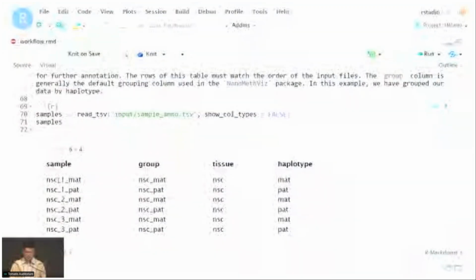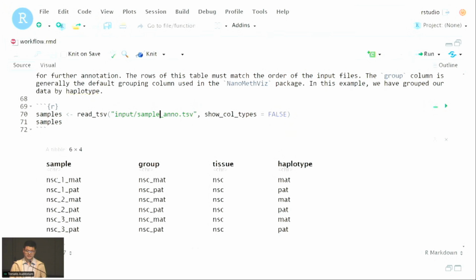so these were neural stem cells, and I've haplotyped them. And that's the reason we have the crossing between pure strains, is that using long reads, you can actually very easily and effectively haplotype most of your reads. So using short reads actually is quite a challenge because your short reads need to overlap informative SNPs. Using long reads, it becomes much easier to do any kind of experiment where you want to haplotype.